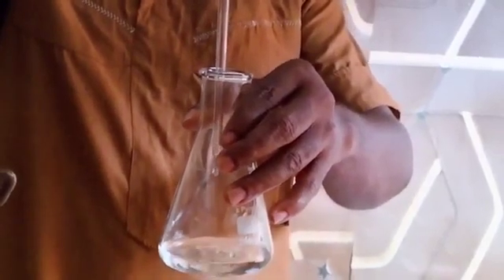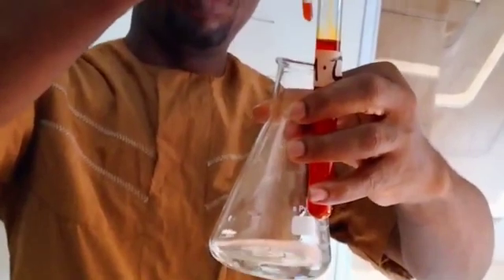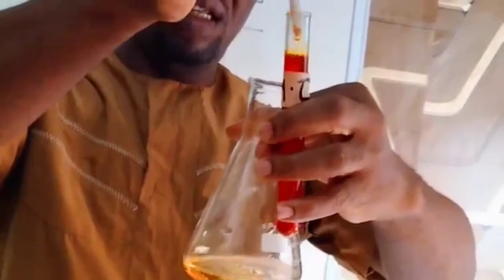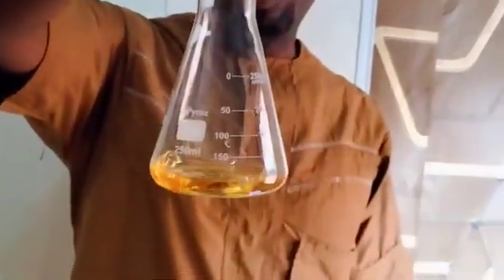Having done that, you now get your methyl orange, freshly prepared. Use a dropping pipette. Collect only 2 drops, 1, 2, because indicators are weak acids or weak organic bases. So you only add 2 drops so that you do not affect the end point of the reaction. So you see the yellow color.